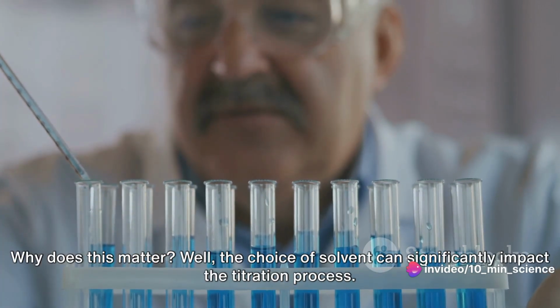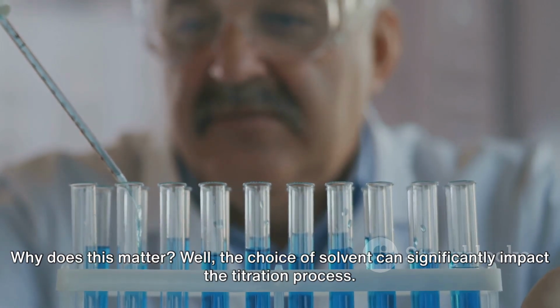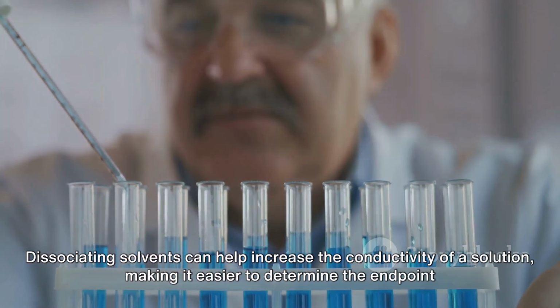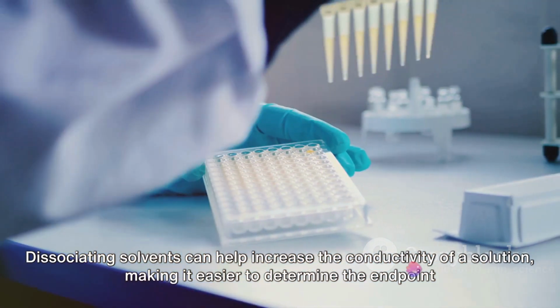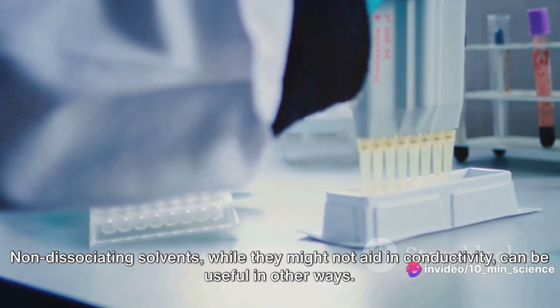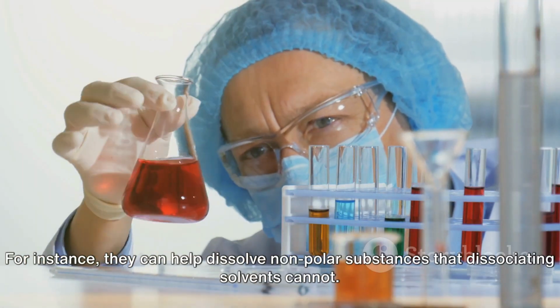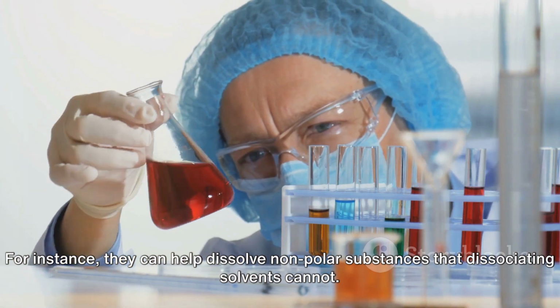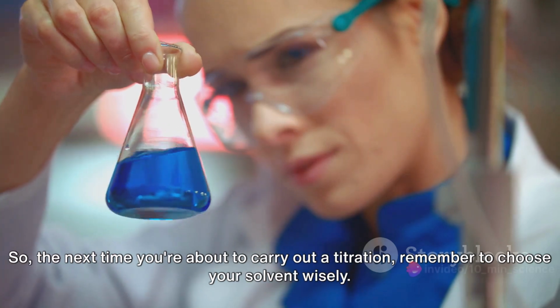Why does this matter? Well, the choice of solvent can significantly impact the titration process. Dissociating solvents can help increase the conductivity of a solution, making it easier to determine the endpoint of a titration. Non-dissociating solvents, while they might not aid in conductivity, can be useful in other ways. For instance, they can help dissolve nonpolar substances that dissociating solvents cannot.